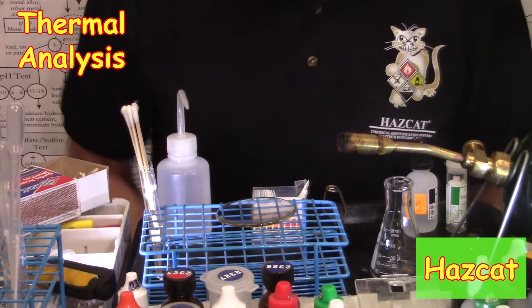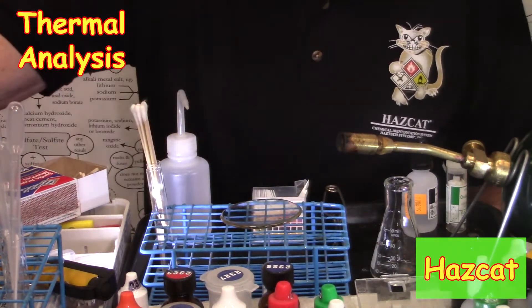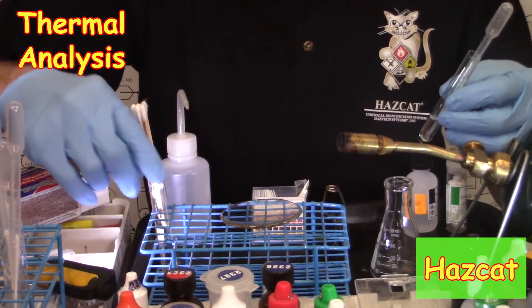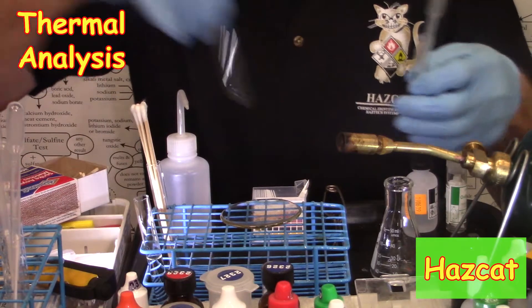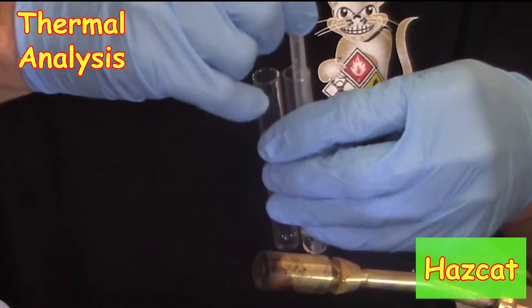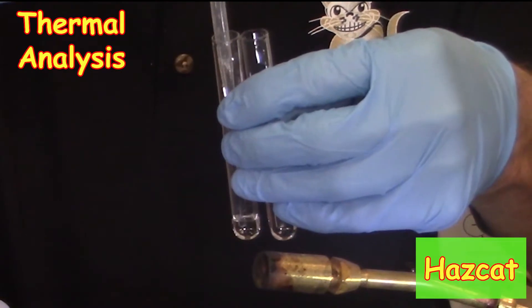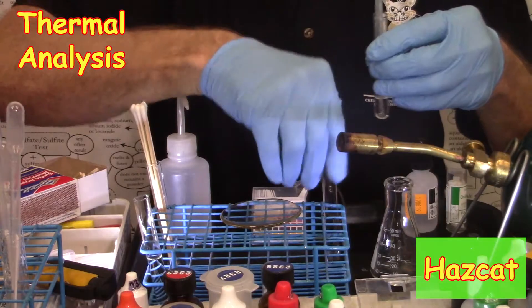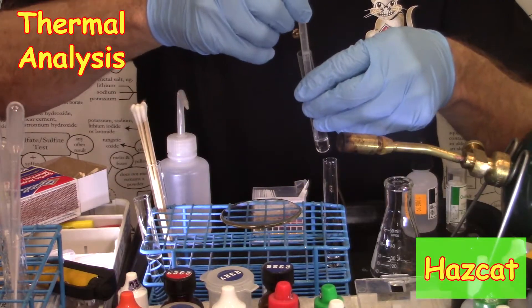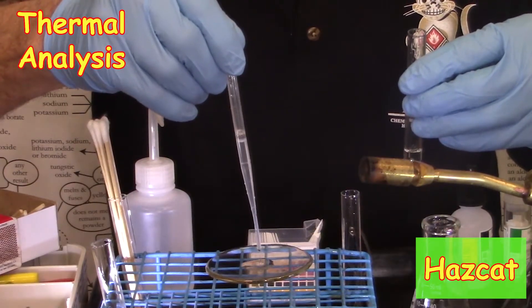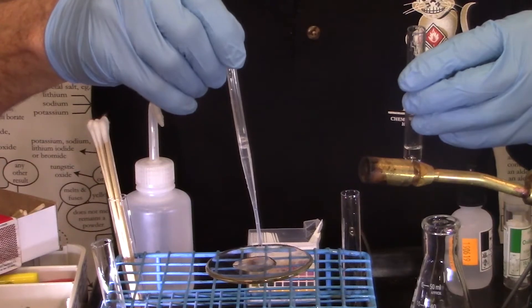Today we're going to conduct a thermal analysis. I'll start by showing you it with a liquid unknown. First thing I do is take a quarter inch of the unknown liquid into a new test tube, and then I need 2 to 4 drops of the unknown on a watch glass.